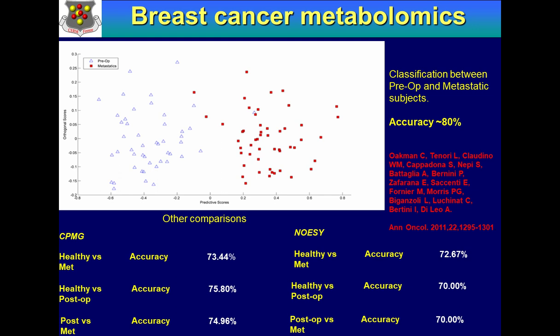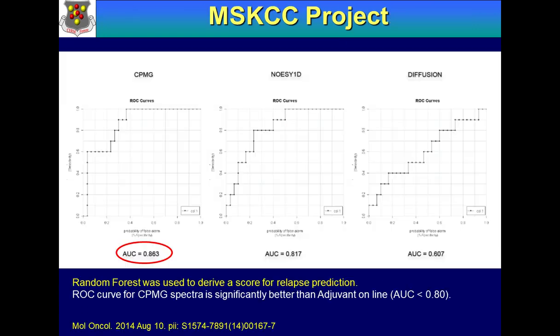Breast cancer is a series of papers that we have published over the years, where we first identified the fingerprint. This is again serum fingerprinting by bucketing. The fingerprint of breast cancer against normal people, but we also could see a clear fingerprint of metastasis against breast cancer without metastasis. And then we thought we might use this fingerprint of metastasis to try and predict recurrence or relapse in women that at the time of surgery had no sign of metastasis, but then after a few years would develop metastasis.